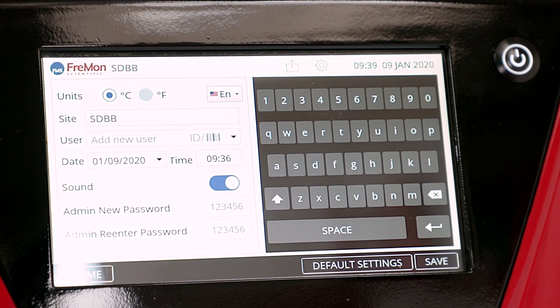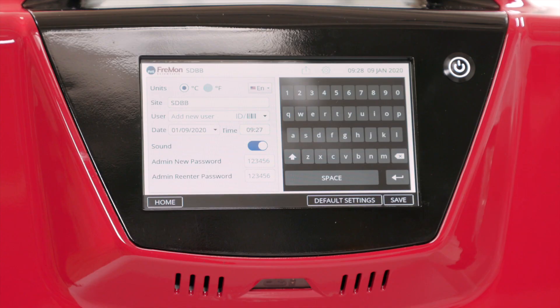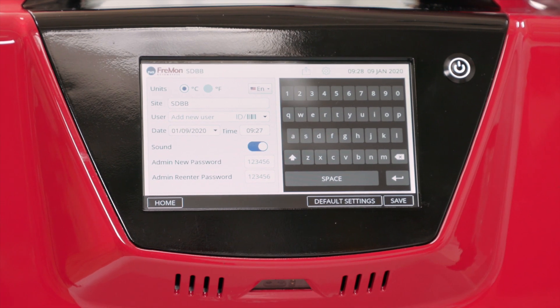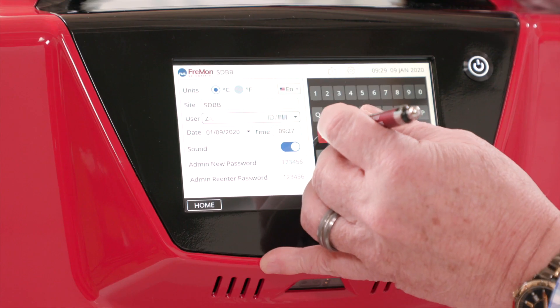Before you use a Zipthaw, add users for each device. Zipthaw can be shared among several people with a default ID, or you can have different discrete users for each device. To add new users, simply swipe their barcode ID at the barcode reader or manually enter their names.